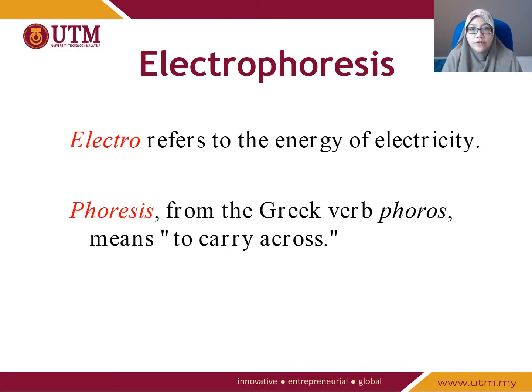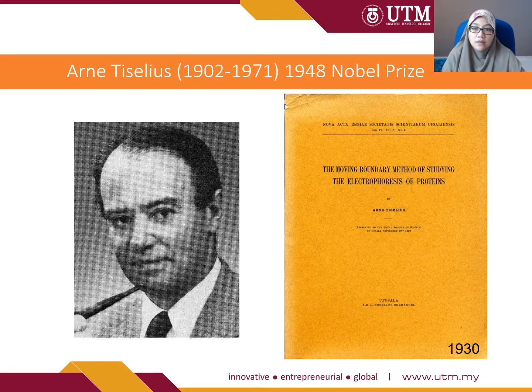Okay, electrophoresis actually refers to two terms, electro and phoresis, whereby electro means the energy of electricity and phoresis means force or to carry across. So maksudnya dengan menggunakan elektrik, kita akan carry all the analytes to separate all the analytes. A little bit on the historical part of capillary electrophoresis.